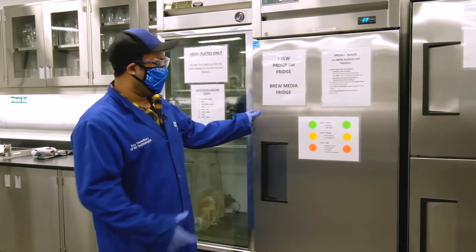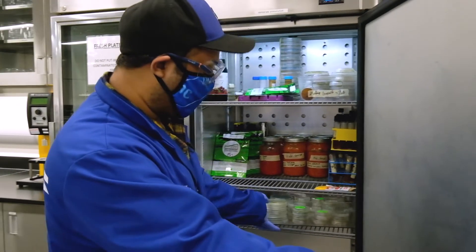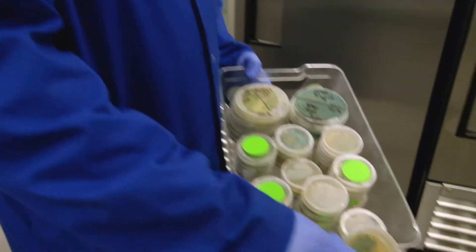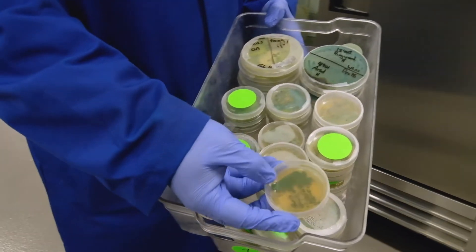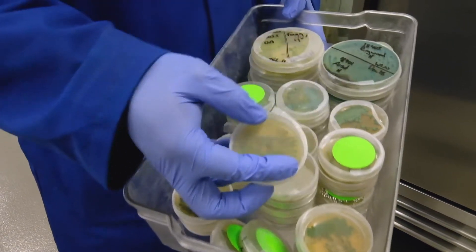We also have the brew program fridge. Students use these fridges and freezers for growing up their microorganism starter cultures. As you can see, students have streaked plates with colonies already growing on them — this is typically what it looks like.